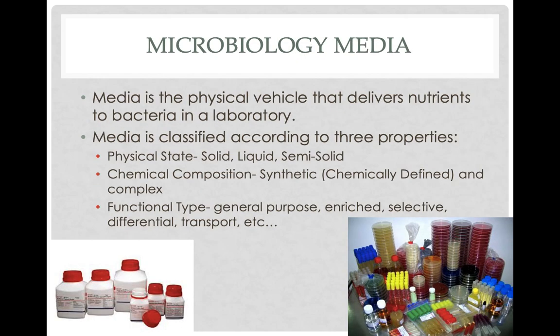So one of the most common tools and ways to identify bacteria in a lab is using media. Media is essentially food for bacteria. So you put bacteria on a petri dish or something, and they've got to have something to eat. Whatever that something to eat is, media is what it's called. Media comes in lots of different flavors, forms, and properties, used for different applications, but essentially it's just bacteria food. You classify it in three different ways: its physical state, how it's put together, and what it's used for.